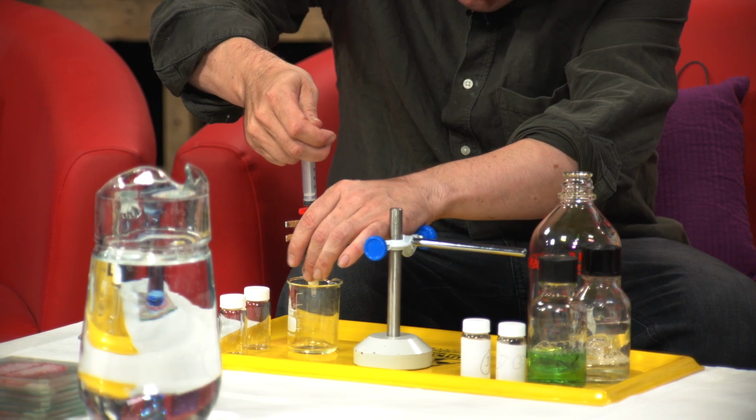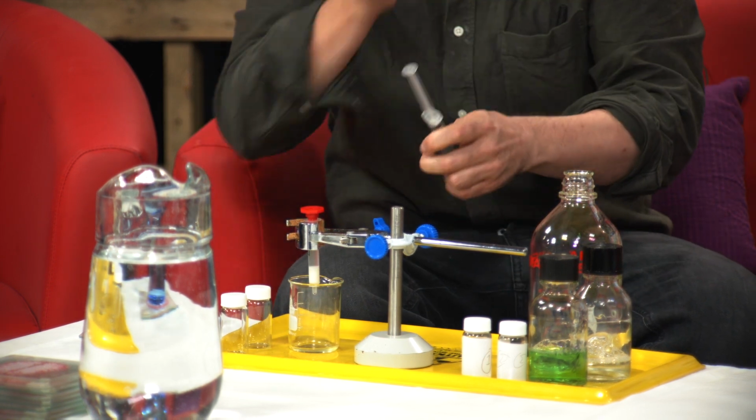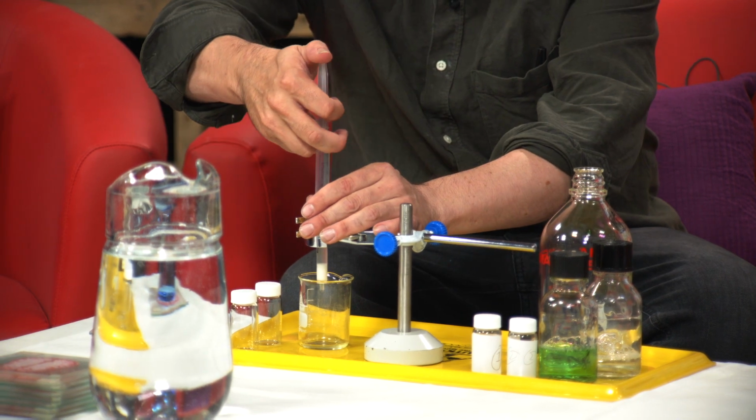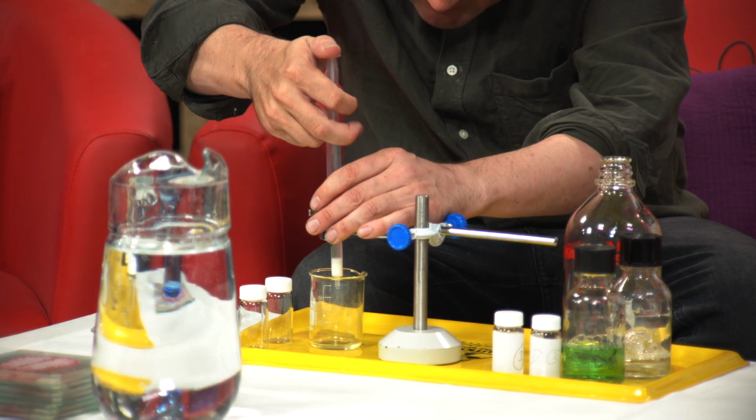So you see it's hopefully coming through, and we push that through. Oh, great stuff. So that's the first one that goes through, and that's because the solid material is all packed together, and you've got to loosen it up. So we do that by running through two solvents to loosen up the packing material. This is where I have to be a bit careful.